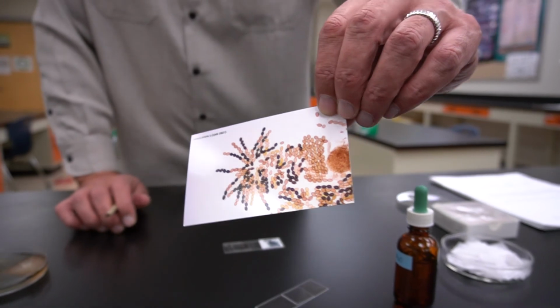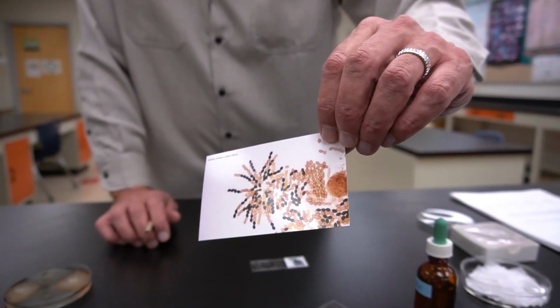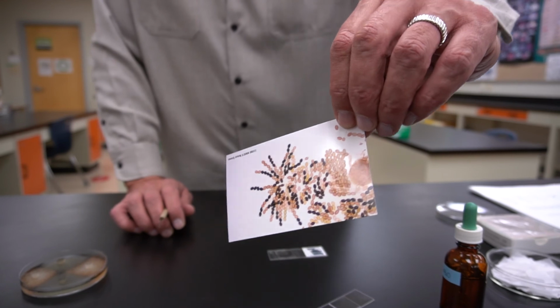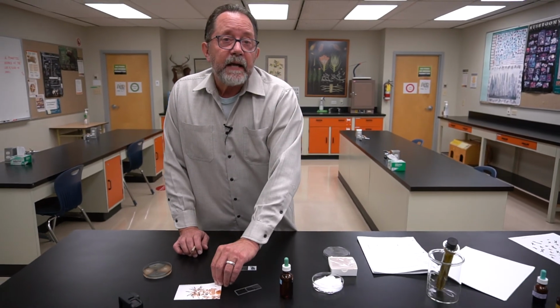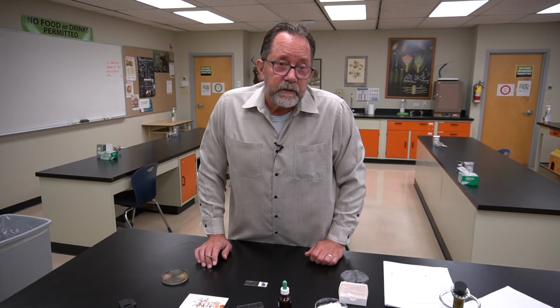So counting up the number of asci that show recombination, 2 to 2 to 2 to 2, or 2 to 4 to 2, compared with the total number, allows you to answer the question, how often does crossing over happen between a gene and its centromere? And that's the data that you'll use to derive and create the maps that I'll assign to you.